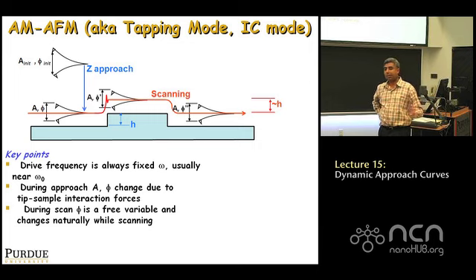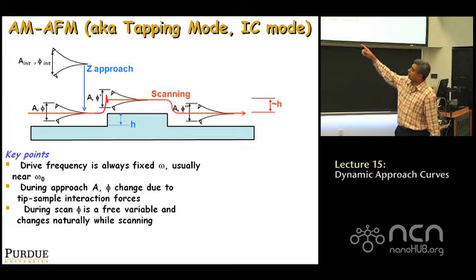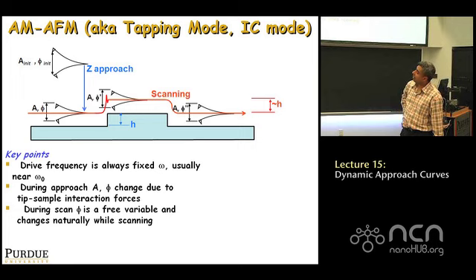Now, in the literature, you will often see this referred to as free amplitude and free phase, because in the AFM literature, free refers to when it's not interacting with a sample. But since we're trying to do this holistically within vibrations theory, free refers to a different thing. It refers to when you just ping it and let it die out naturally. So we won't mix it, and we'll just call this the initial amplitude A_init, initial phase phi_init. And as you approach a sample, the amplitude and phase would change to a value A and phi.